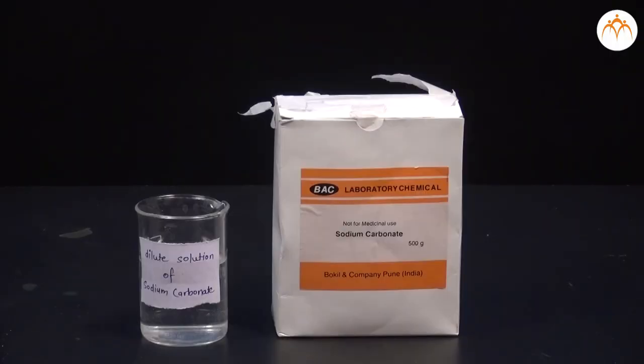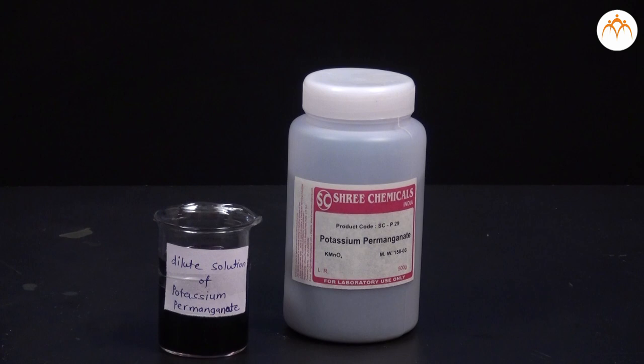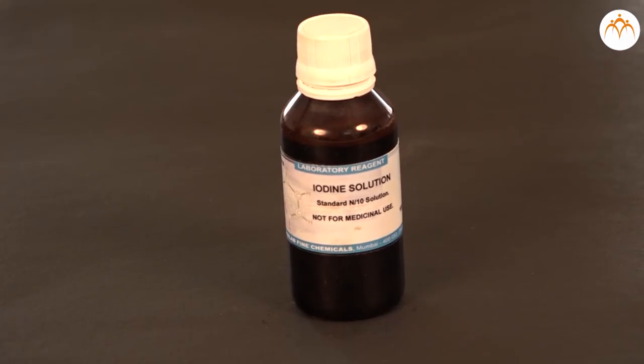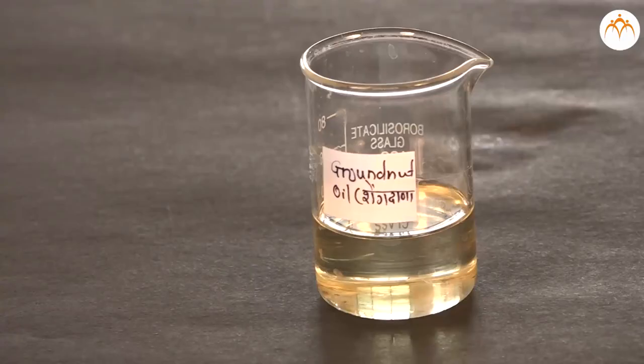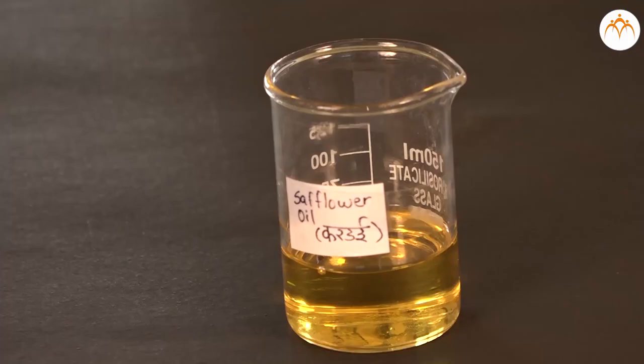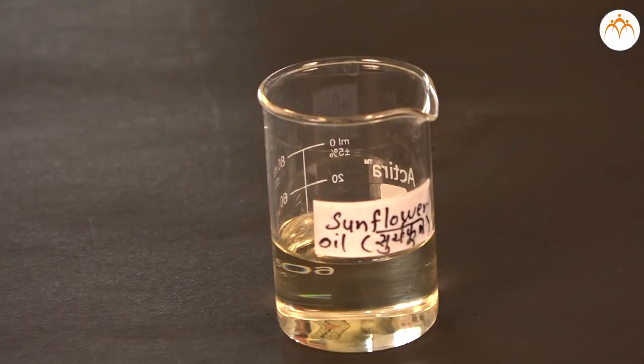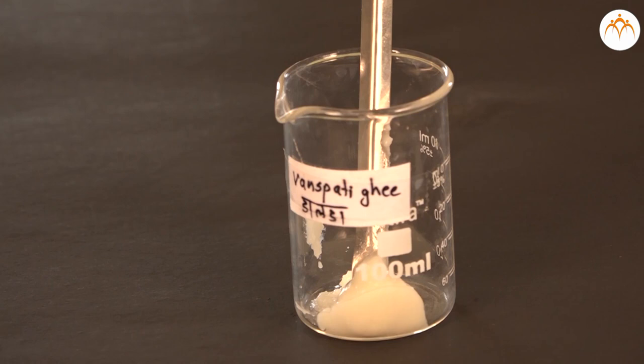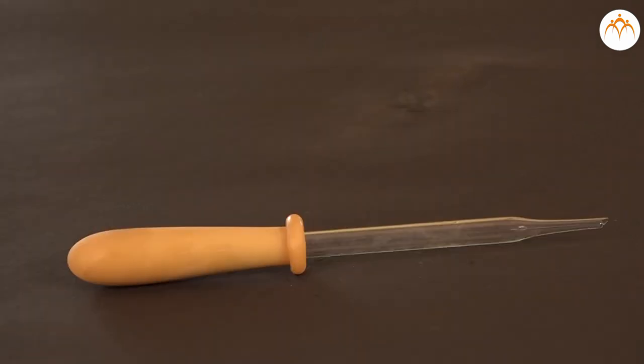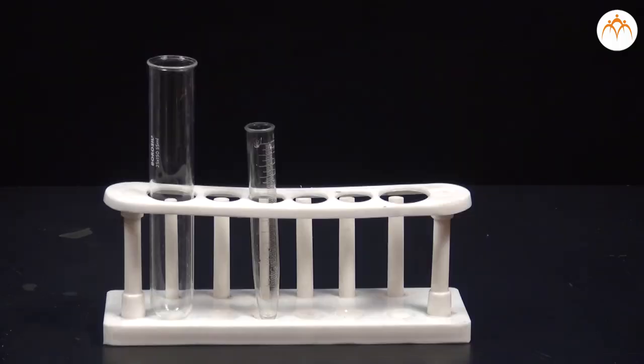Let us study oxidation and addition reactions of carbon compounds, that is fatty acids. We require ethanol, dilute sodium carbonate and dilute potassium permanganate, tincture iodine, groundnut oil, safflower oil, sunflower oil, vanaspati ghee, dropper, burner or spirit lamp, and test tubes.